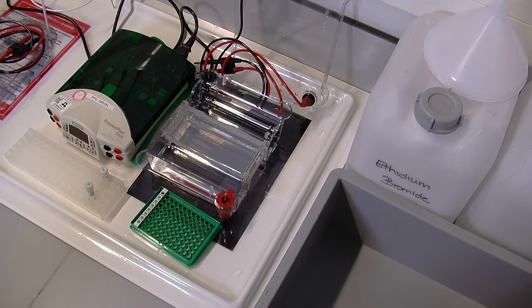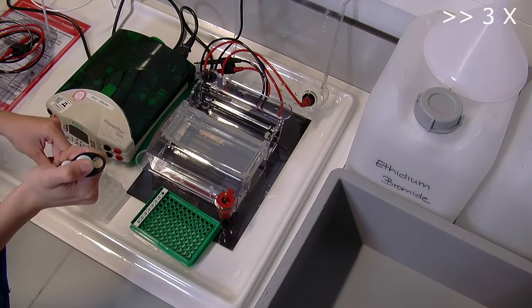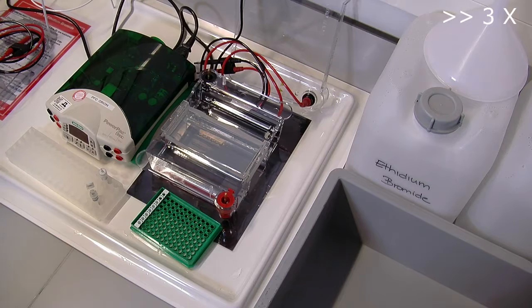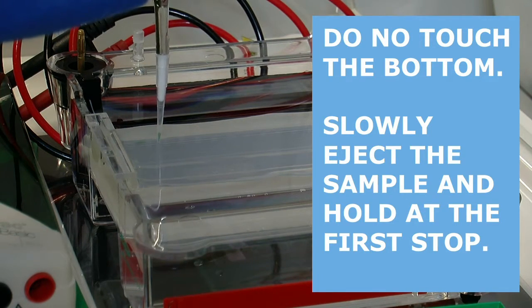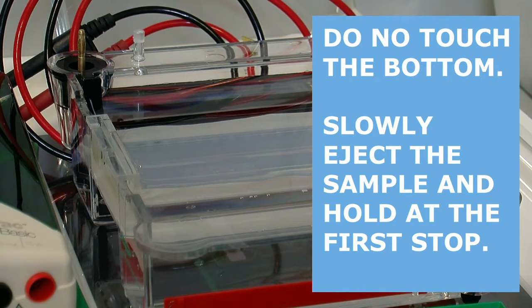Add dye to the samples and mix well. Now you have to load the samples on the gel. Do not touch the bottom, but while you lower the tip of the pipette in the slot, slowly eject the sample from the pipette. Hold at the first stop and remove the tip of the pipette from the slot. Don't forget the marker. Load the marker on the gel if needed.